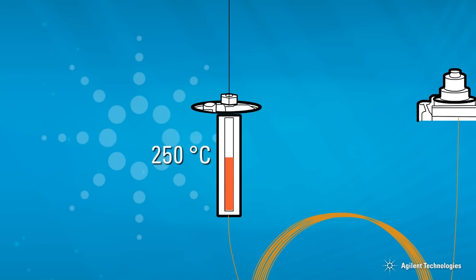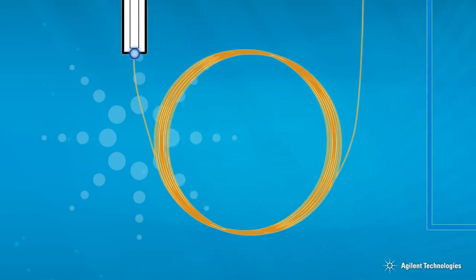When the sample goes into the heated inlet, it is very rapidly vaporized. This results in a momentary increase in the pressure inside the inlet. Once the sample is vaporized, it can then be swept into and through the column by the carrier gas. The sample moves in a tight band into the GC column, which is initially held at a low temperature.